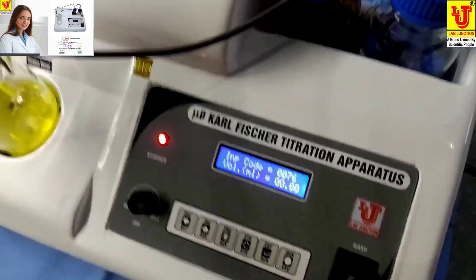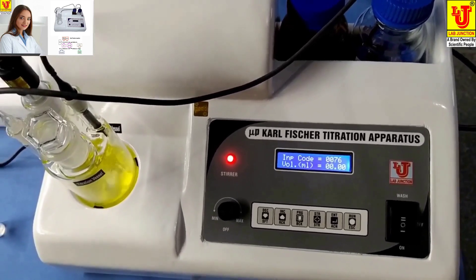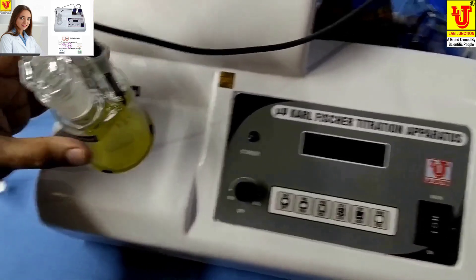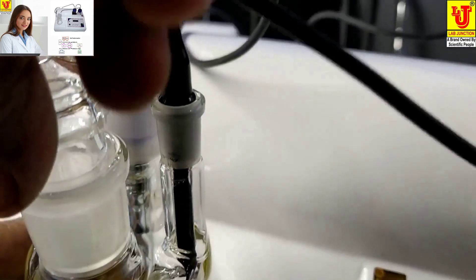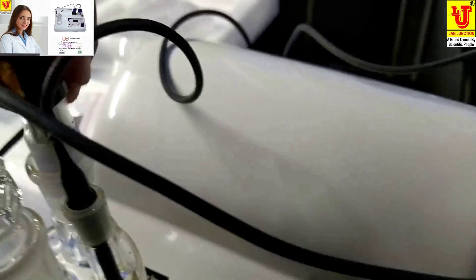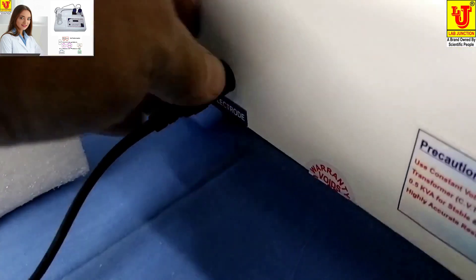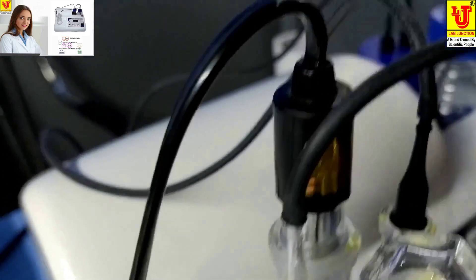Now the main part is how to assemble this instrument. First, install the Titration Vessel with two nozzles and the Sampler Mouth. Connect the Karl Fischer Electrode on this spot. On the backside of the instrument is the Peristaltic Pump.